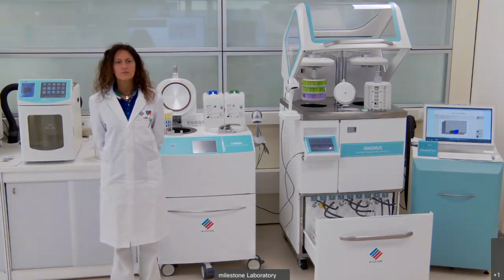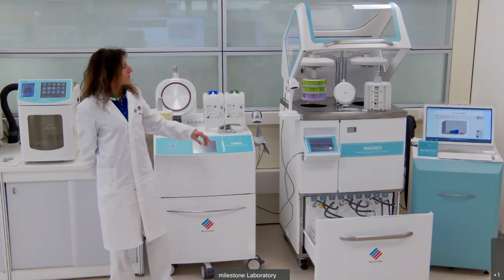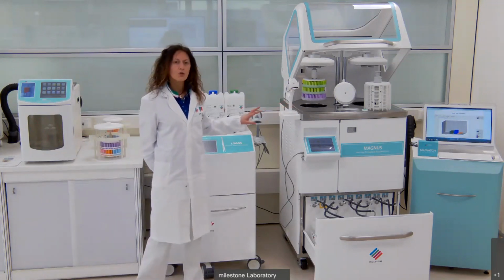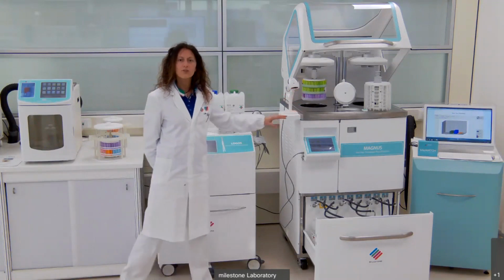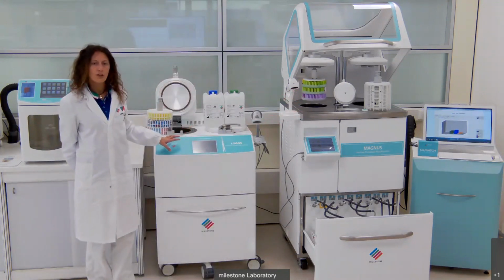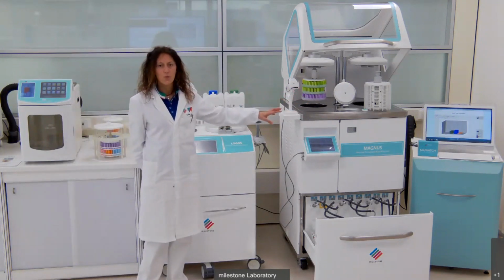Thank you, Lisa. Now there's a question about the auto-embedding technology. Is it available only in Magnus? No. Synergy is available also for Logos. So Synergy is compatible with Magnus and also with Logos, thanks to the specific rack and specific consumable.